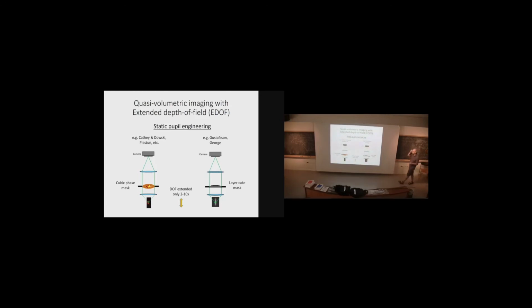So how can you go very, very fast? Well, one thing you could do is forget about volumetric imaging, and use this sort of extended depth of field imaging, and you can do that with wavefront engineering. You can use a Bessel beam wavefront, or you can use these other types of wavefronts. The problem with Bessel beam, I'm back to one photon here: if you use a Bessel beam illumination with one photon, it doesn't work very well. There's very little power at the focus. There's a lot of power outside the focus.